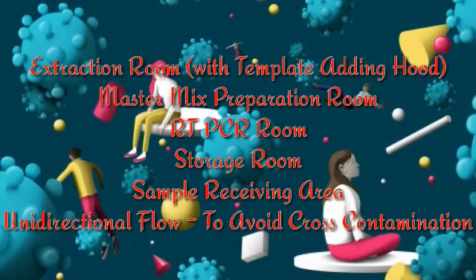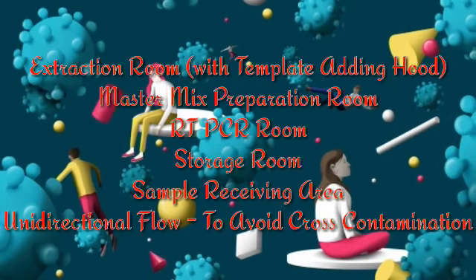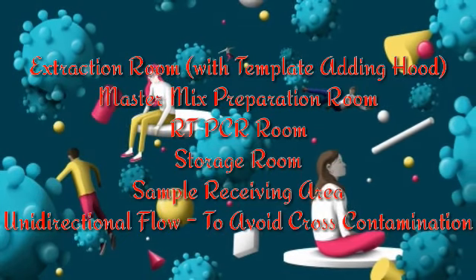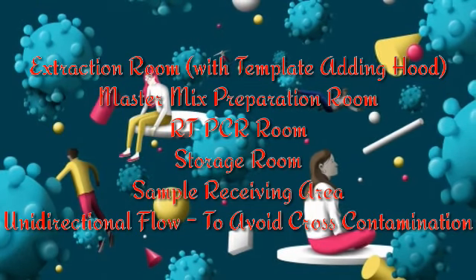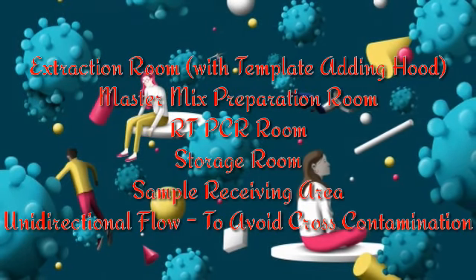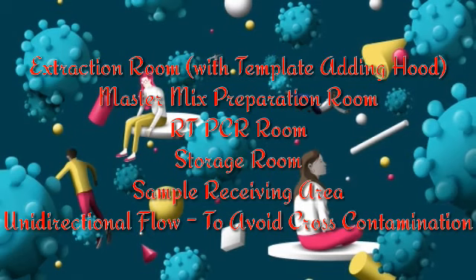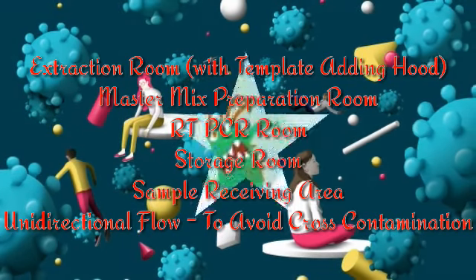Now, what are the infrastructural requirements? Infrastructural requirements include an extraction room, a master mix preparation room, and a real-time PCR room. The extraction room can be accompanied with a template addition hood, which is again a mandatory requirement as per NABL.